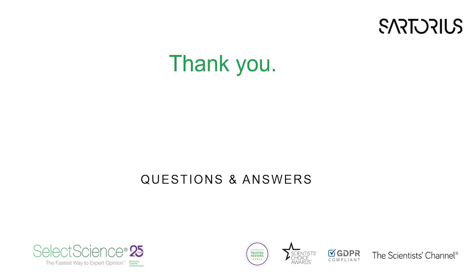Great, thanks a lot. And what is the difference between the Picus 2 and Picus and the Picus NXT? Okay, so we've added a few things in. Obviously the connectivity features, so Picus 2 can be used over a Bluetooth connection. We have improved the color display, so it's new and it's even better. Protocols have been moved to a Sartorius pipetting app. So there is no longer a menu entry called protocols in the pipette, but you do need to use the mobile app.